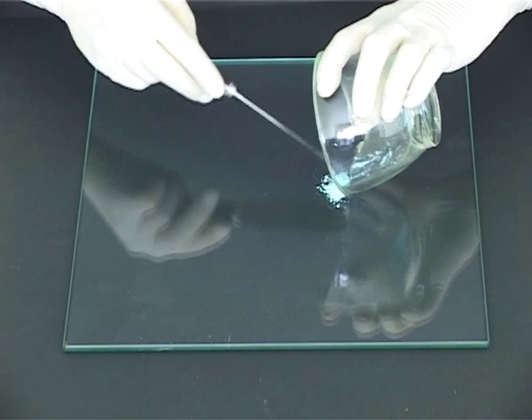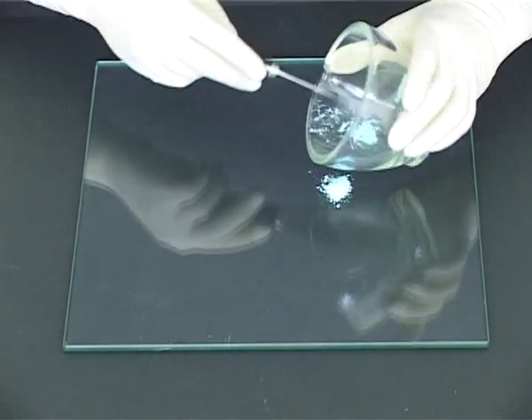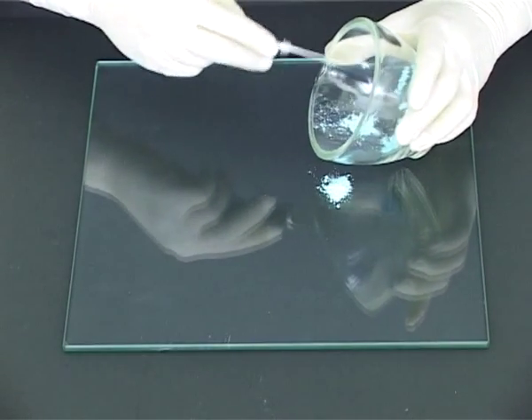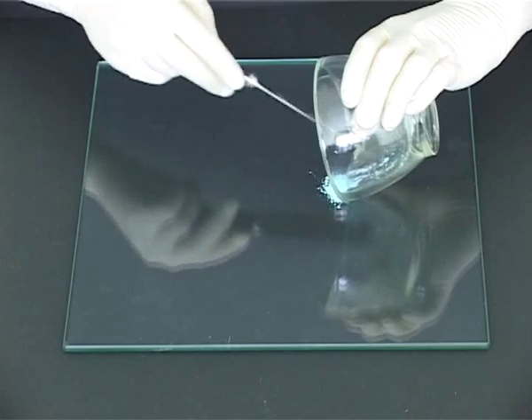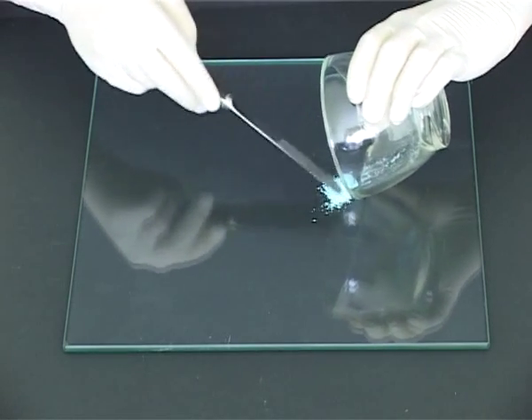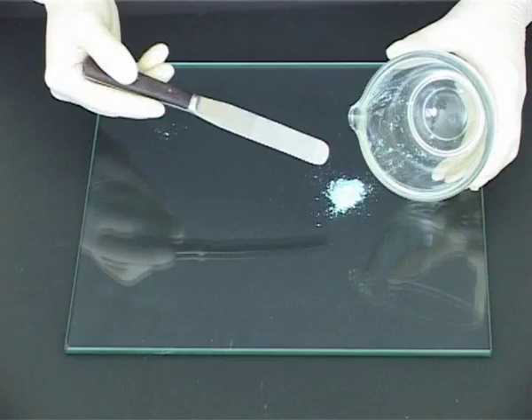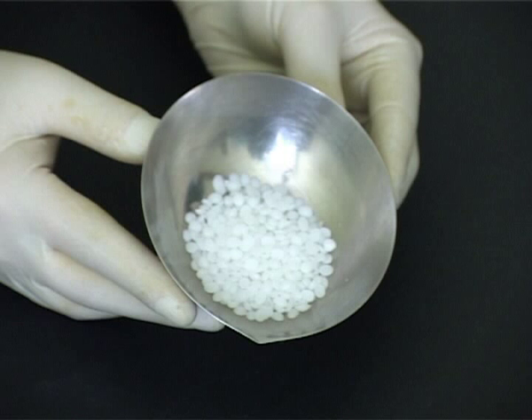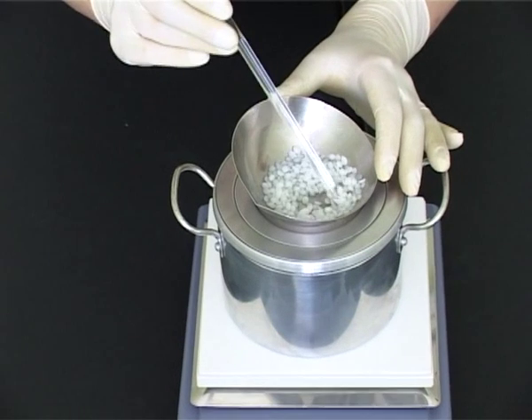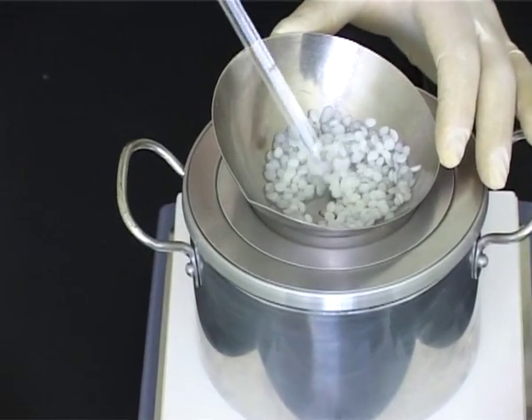Transfer the powder to a clean glass tile using a spatula. Place the previously weighed suppository base into an evaporating basin and place the evaporating basin on the water bath.